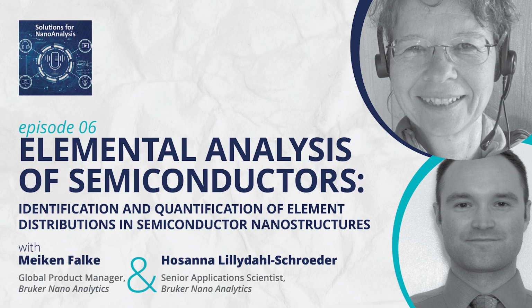So the EDS part is a bit of a funny story. I was lucky to be one of the first setting up user facilities for aberration-corrected microscopy. And there we had really high-end aberration-corrected microscopes. That was at the SuperStem laboratory in the UK. And as a spectroscopy technique there, we used EELS. Now, EELS is a really powerful technique, and it comes with really high energy resolution now, reaching infrared spectroscopy level. And at some point, somebody came to SuperStem and said, shouldn't we add EDX to our TEM? And we all said, no. We do everything with EELS. We don't need EDX at all.